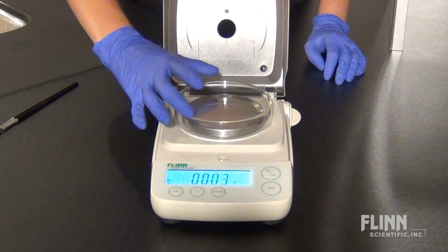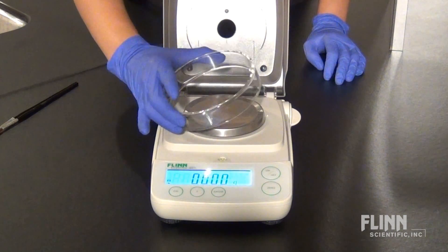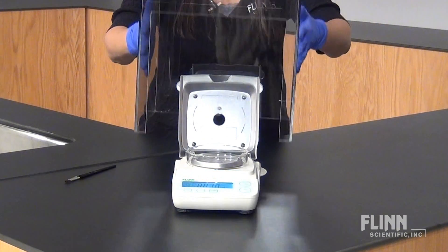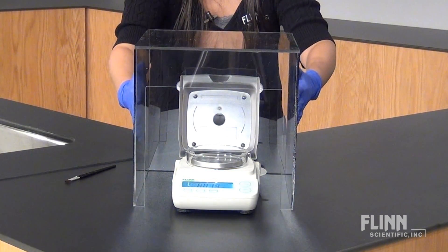Finally, we recommend always using a draft shield. Most milligram balances include a small draft shield, but a larger draft shield will help collect accurate readings as well.